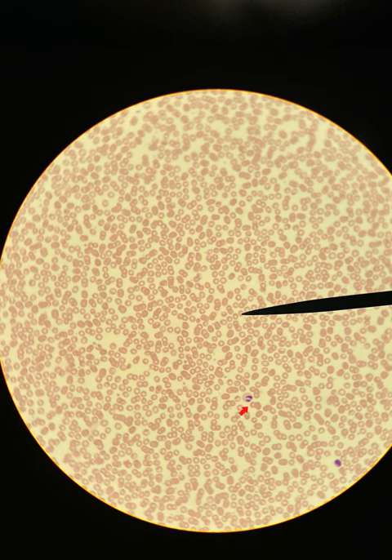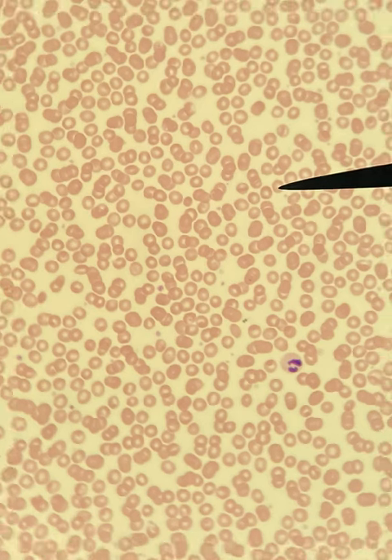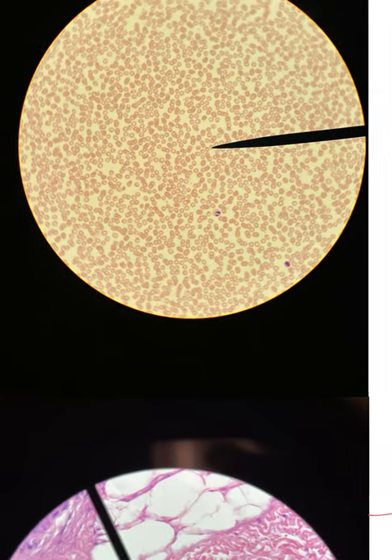And then we also have leukocytes, which are better known as white blood cells, and they have a very important role in immunity. And then here, if we look even closer, let me zoom in, these are thrombocytes. These guys actually aid in clotting. If you need to know the spelling of any of this, feel free to look back at the very beginning of the video. I just want to try to keep it as short as possible. Oh, and blood is found, of course, in the veins and the arteries.